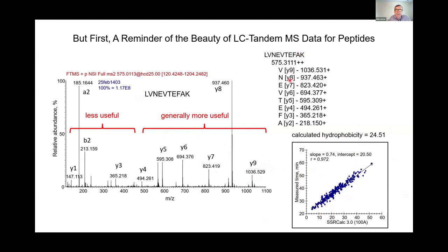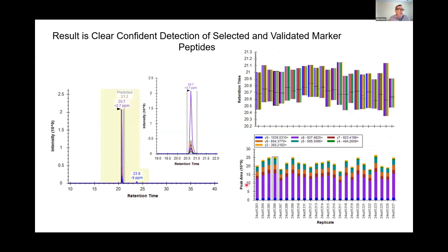So on top of being able to predict how the mass spectrometer is going to see it, we're also able to predict where it's going to show up in our HPLC chromatogram. As you get your HPLC system calibrated, these are really good to a couple or 3 minutes, so it's a relatively modest time window.